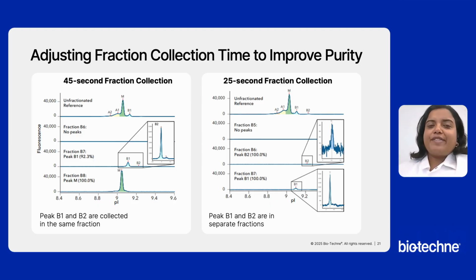So once we have successfully collected our peaks of interest, we would now like to focus on the purity of each fraction that we have collected. In order to increase the purity of each fraction, we recommend reducing the fraction collection time. Reducing the fraction collection time, as you can see here in the figure on your left at 45 seconds to the figure on the right at 25 seconds, we could improve the purity of this charge variant based on our Maurice icIEF result.